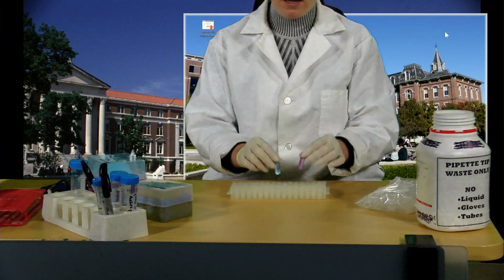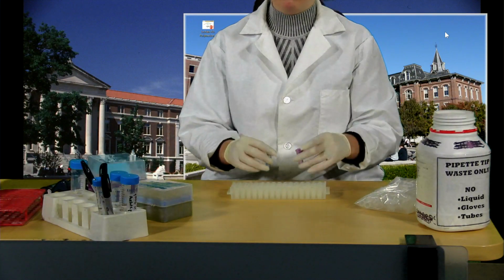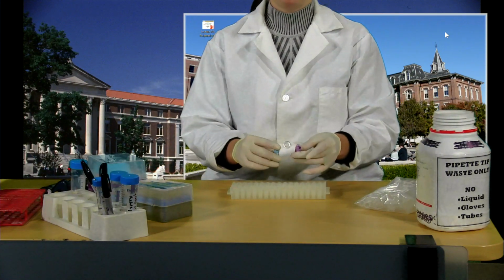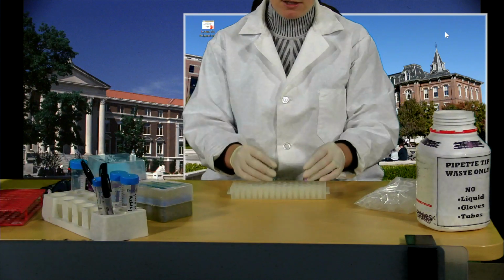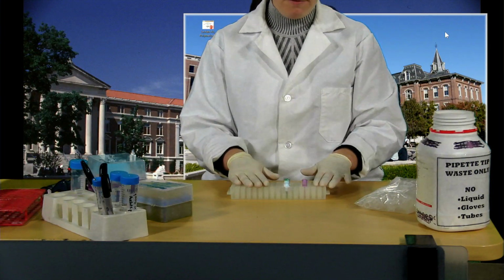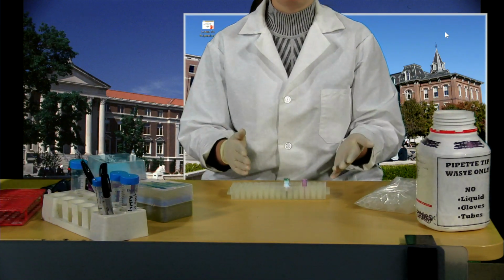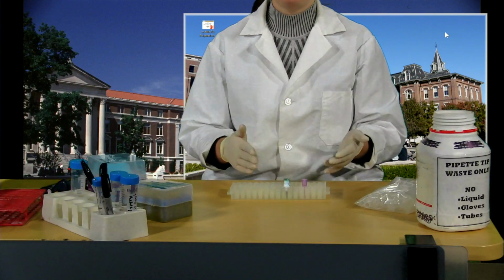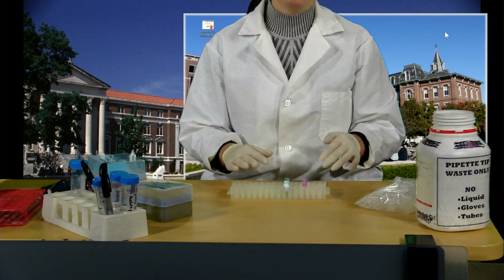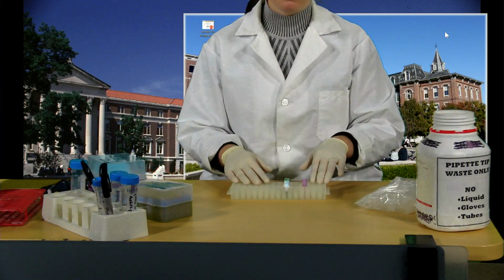So, depending on the amount of enzyme that's present in each of these fractions, if I give them the same amount of substrate, I can then measure the amount of product that's made and determine how many units of activity that I have. So, the first thing that I'm going to think is, well, I have no idea what concentration of enzyme I have here, if it's super concentrated. What I do know is that my enzyme needs to incubate with the substrate for 5 minutes.